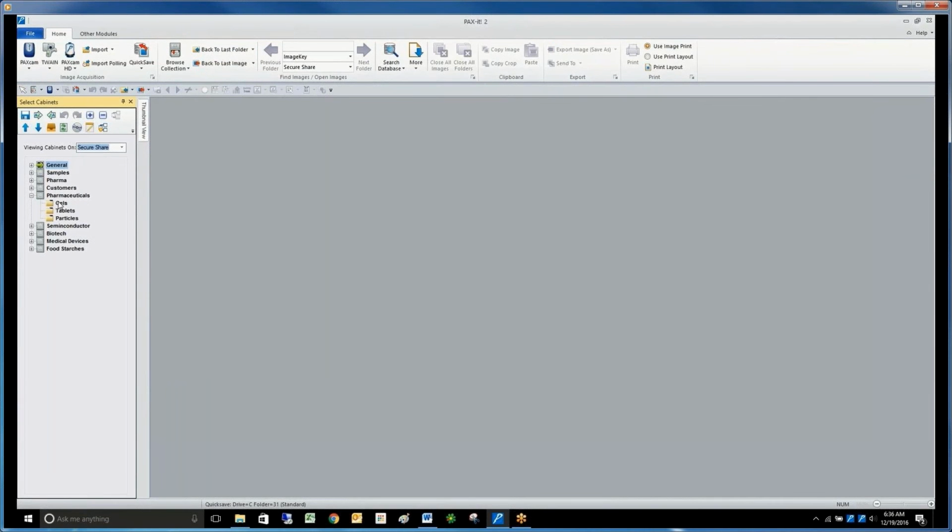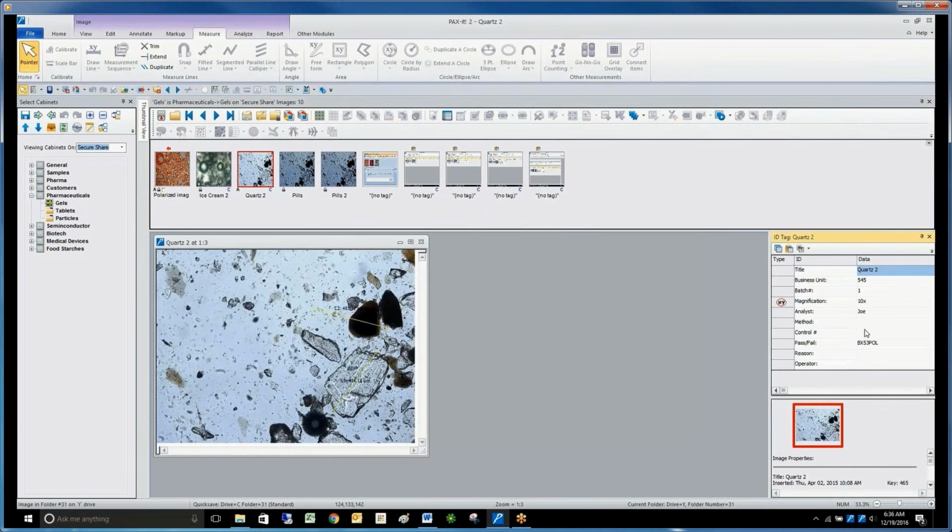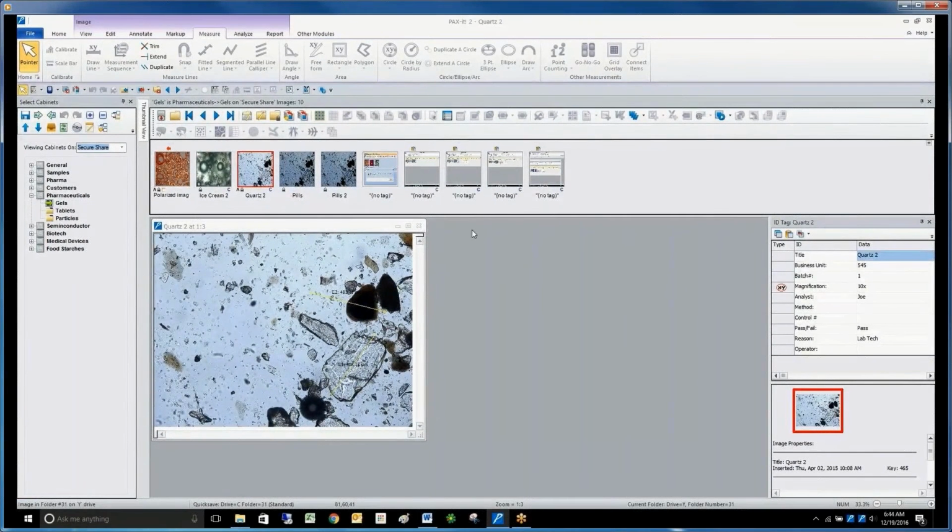Files are accessed directly in the application through a Windows Explorer-type folder tree, making the assembly and navigation of your collection familiar and accessible. Open folders display image thumbnails for easy identification, and once open, the image's database information appears alongside it. As we will see shortly, the database is also the resource utilized for audit trail logs and digital signatures. We'll check out digital signatures first.